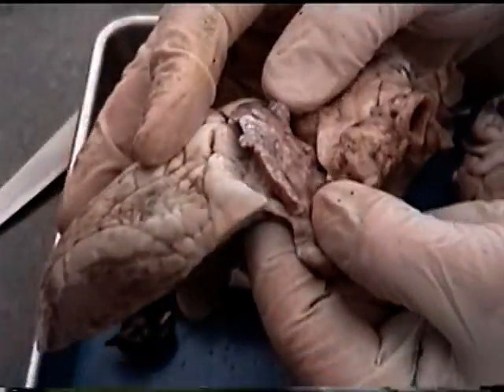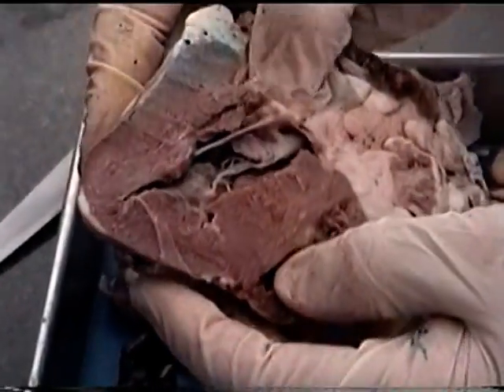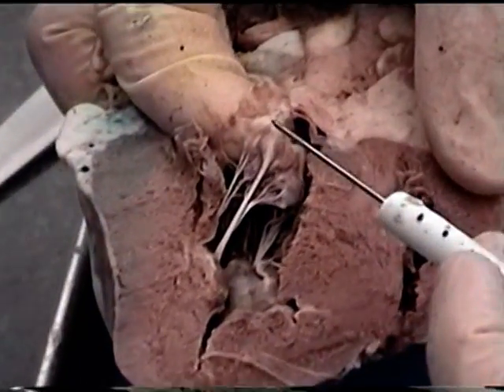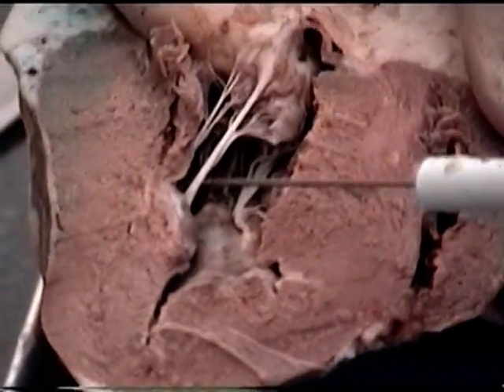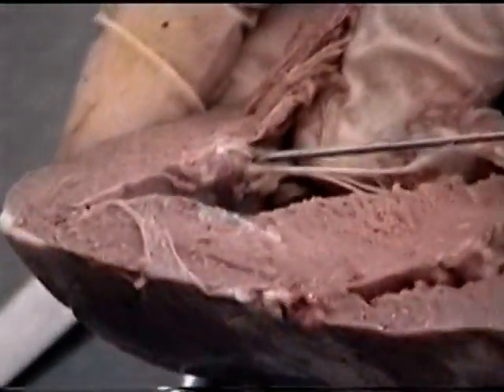Now the upper chambers are atria, so what we're seeing here is the left atrium with its auricle. And then remember there's a valve that separates the left atrium from the left ventricle. So what we're seeing here is one of the flaps of the valve. So remember on the left side it's called a bicuspid valve because it's going to have two of these flaps. And then the flaps are connected to chordae tendineae. And the chordae tendineae are connected to papillary muscles. So we can actually see the papillary muscle here, the chordae tendineae, and the valve.